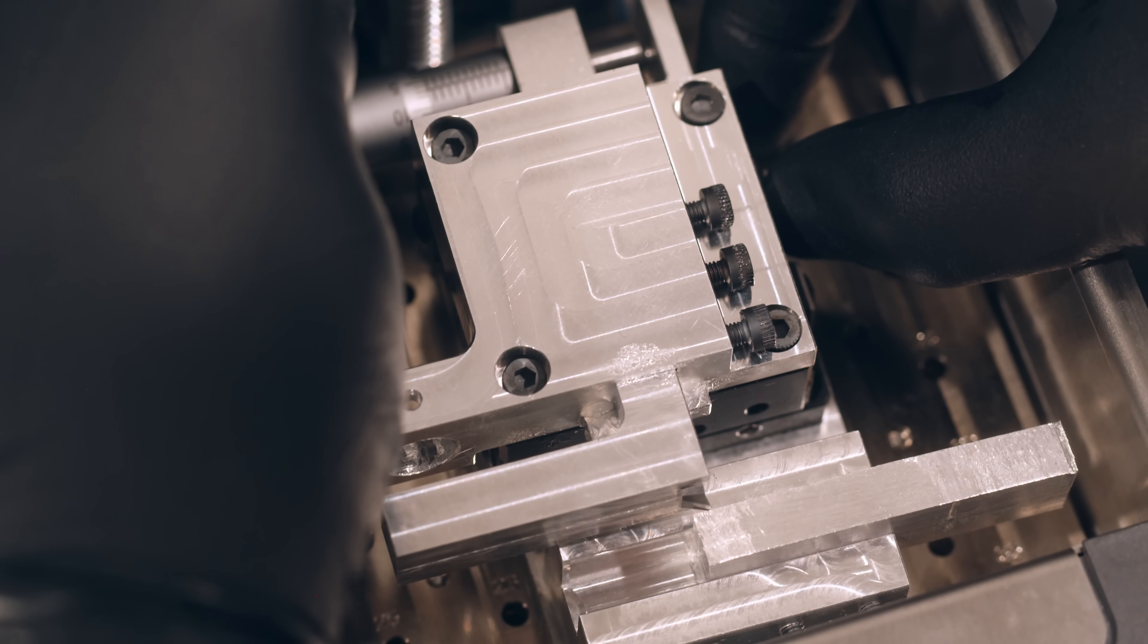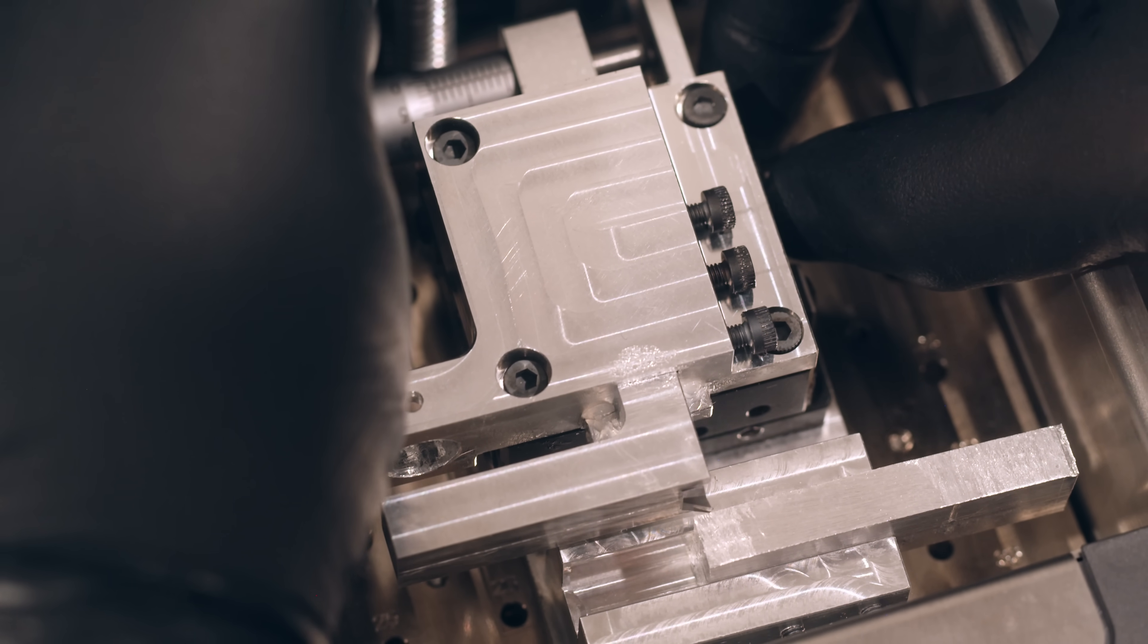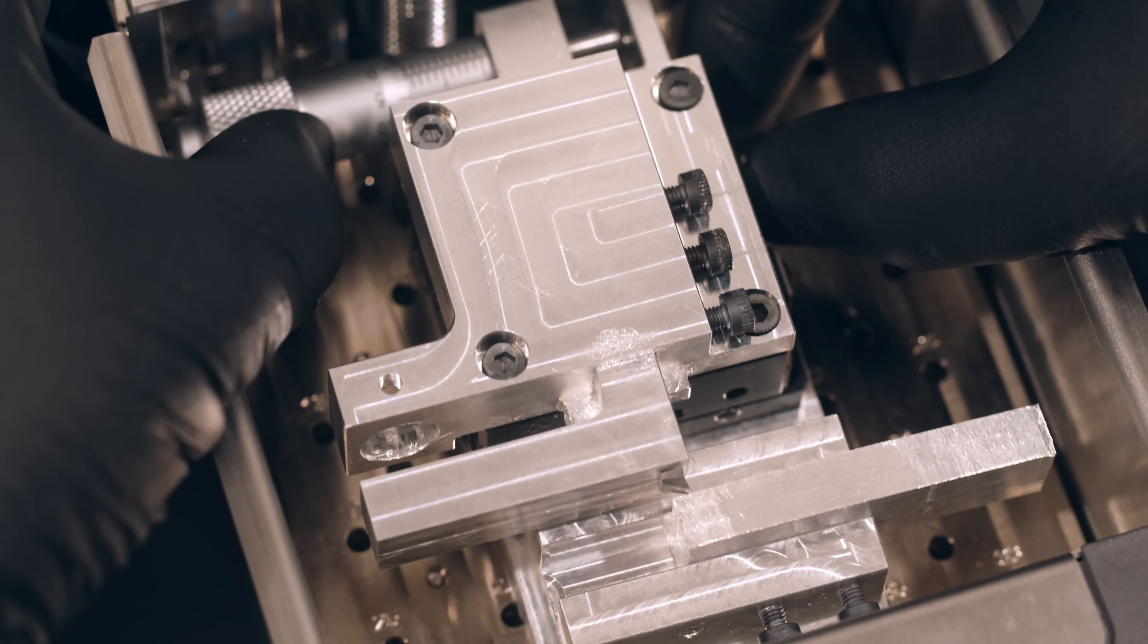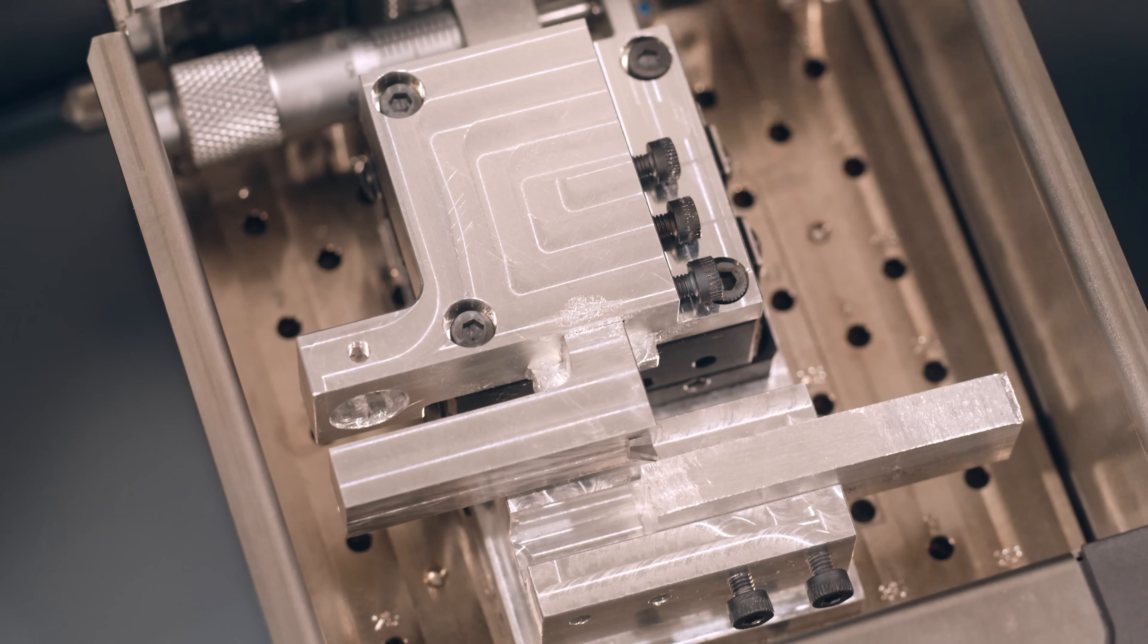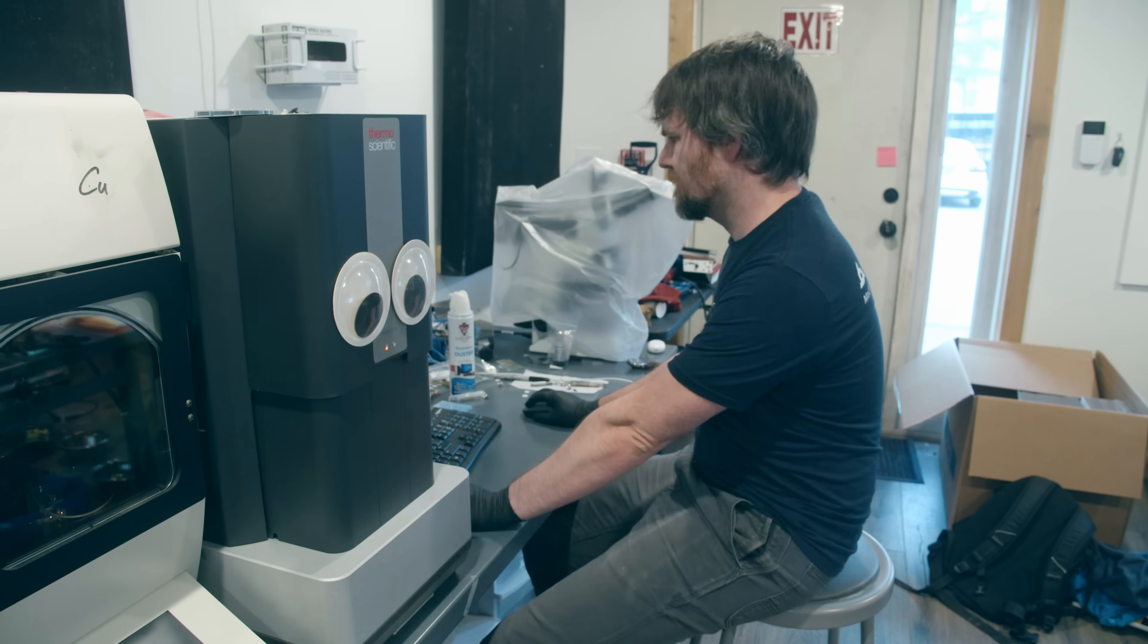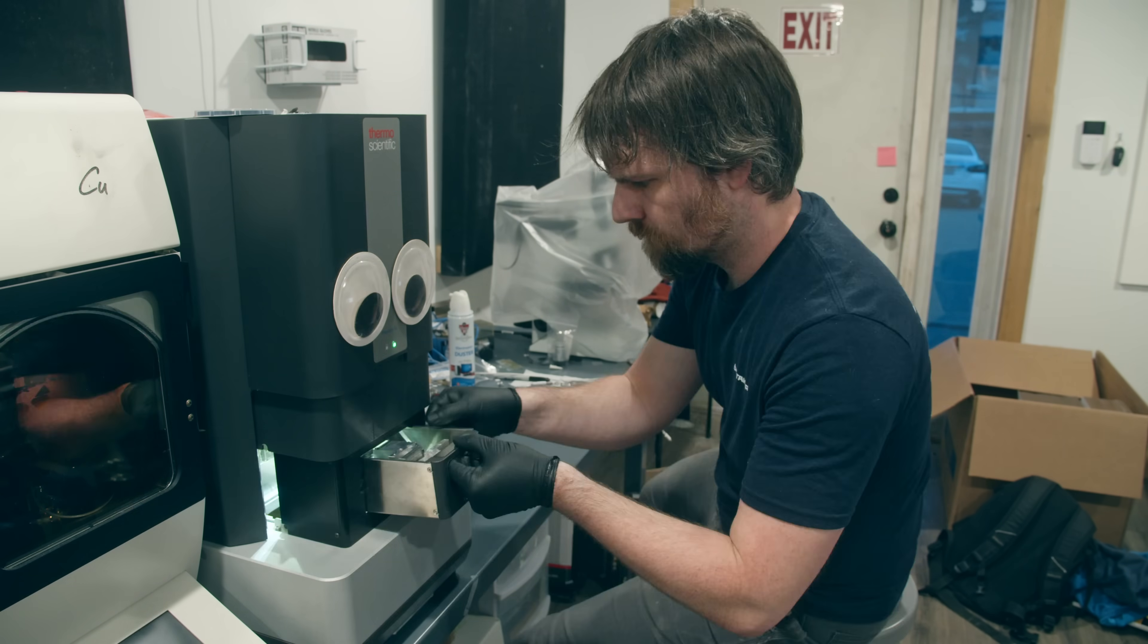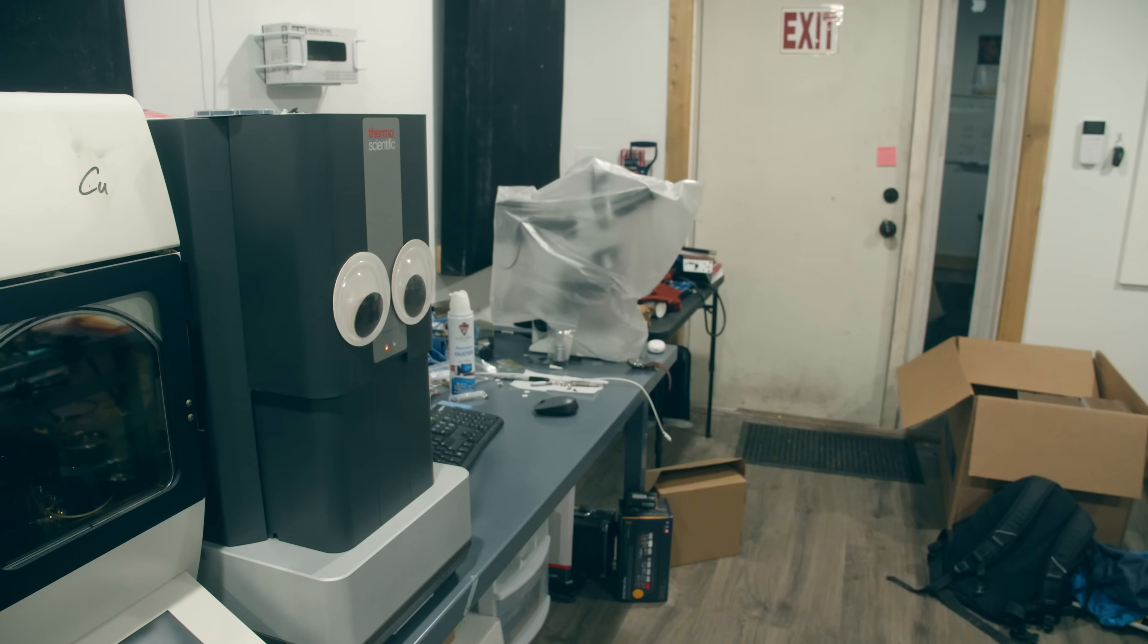I don't really know why but I didn't think this would take too long. Like I knew it would take a little while taking it in and out of the microscope but I assumed it'd be like an hour or two and I'd be done. I was very wrong. This takes about five minutes from putting it in the chamber to pulling it back out of the chamber and repositioning. And I took about 70 photos so you can do the math. I was here for a little while. But honestly I'm not even mad about it. It was totally worth it. I mean how cool is this?